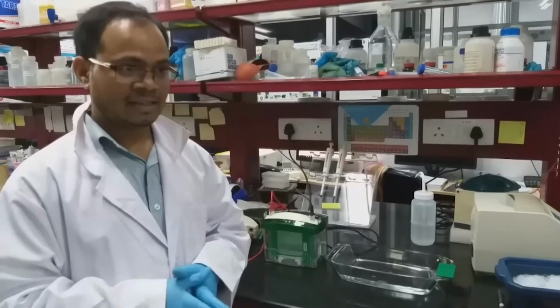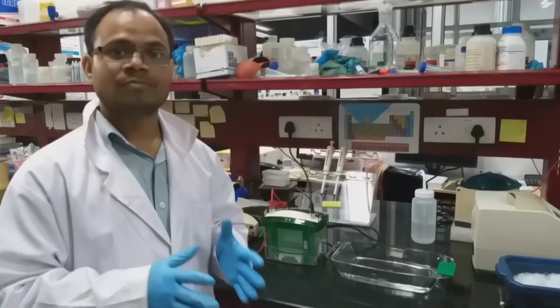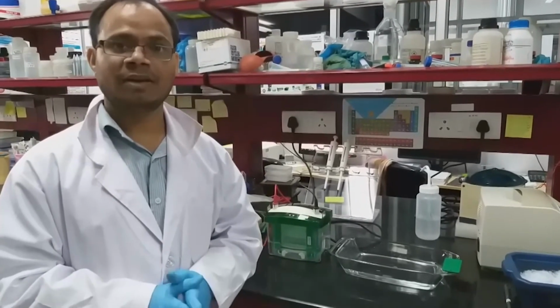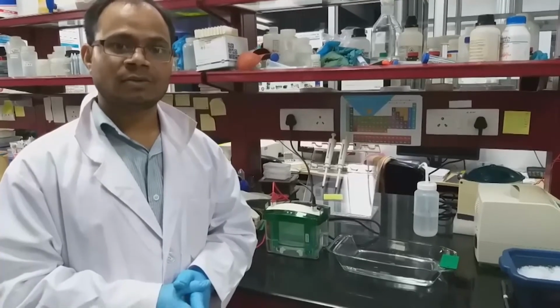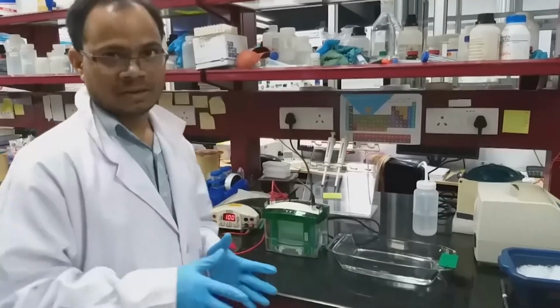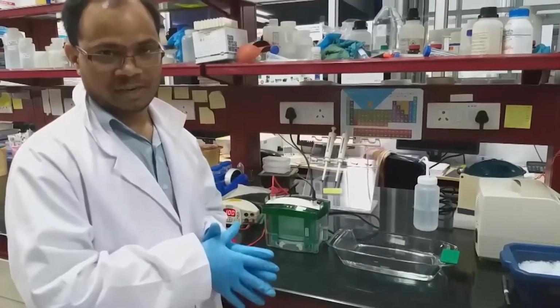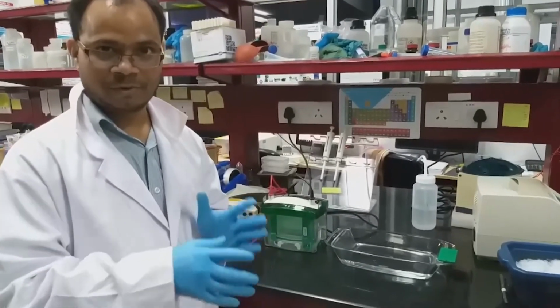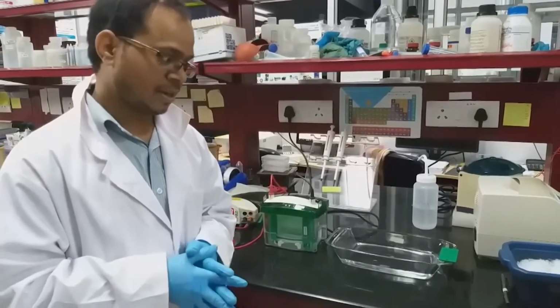But in another way, the simplest way, we just stain the gel for 2 hours, then we de-stain overnight. So I am going to show the simplest way. First we will stain in Coomassie brilliant blue staining solution, then we will de-stain in methanol water solution.